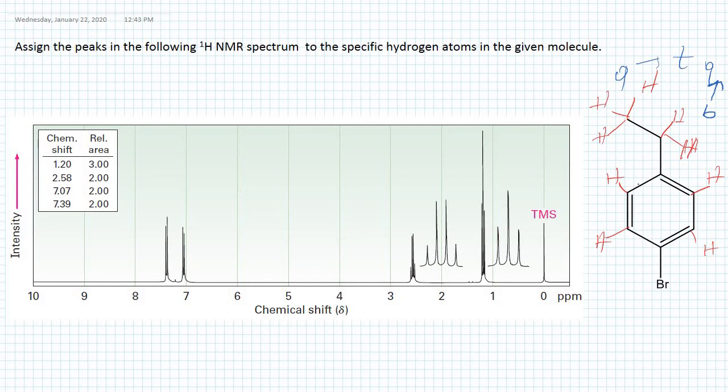Then let's move to ring, aromatic ring. So we have C, since these are equivalent protons, I'm labeling them as C. Then next ones are D and D, so I'm labeling them as D. So let's look at them. So the protons located at this position, or C protons, let's say, they will appear as, because each one having 1 neighboring proton, or equivalent, just 1 equivalent proton, so they will appear as doublet.